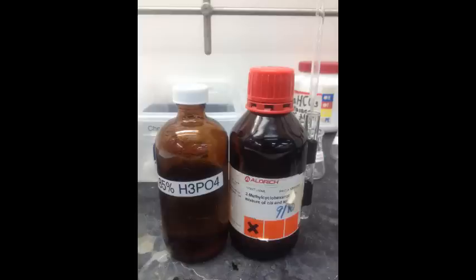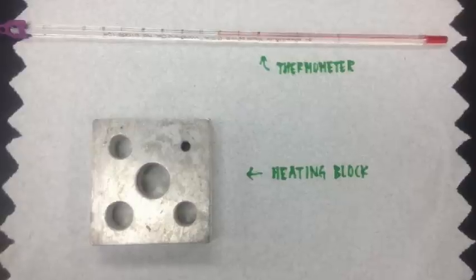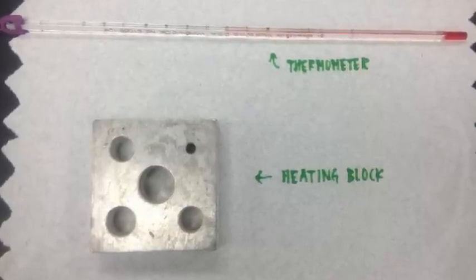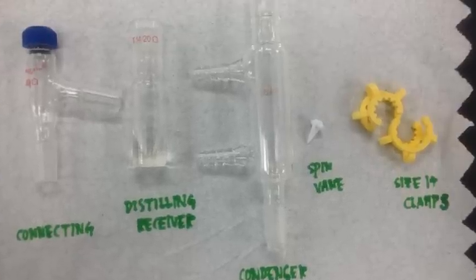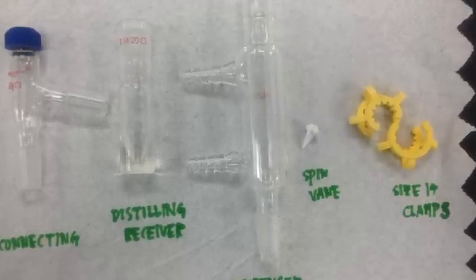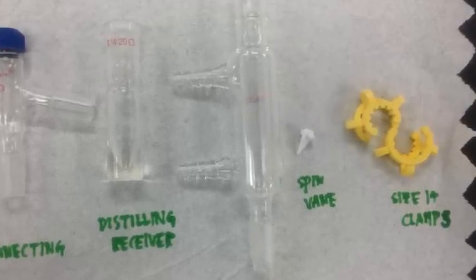Chemicals used in this lab include 2-methylcyclohexanol on the right bottle and 85% phosphoric acid on the left bottle. Anhydrous sodium sulfate is used as drying agent. Equipment includes thermometer, heating block, connecting distilling receiver, condenser, spin vane, and size 14 clamps.